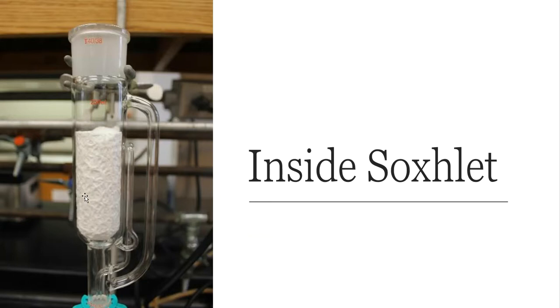How do you know if you are choosing the appropriate thimble size? Well, the top of the thimble normally comes to the top of that elbow right there, okay? And here, mine doesn't. It goes up a little bit higher, but that's okay, as long as the nuts on the inside of this thimble are below that elbow. That's really what I watch out for.